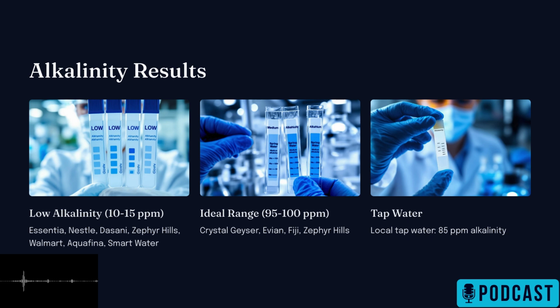Oh, wow. Okay, that's certainly good to hear. Yeah. For instance, the estimated fluoride level in the tap water was around 1 ppm, which is pretty typical, often intentionally added for dental health. Right. The total alkalinity of the tap water was 85 ppm. And the levels of chlorine, which is used for disinfection, were quite low: total chlorine at 0.8 ppm and free chlorine at 0.2 ppm.